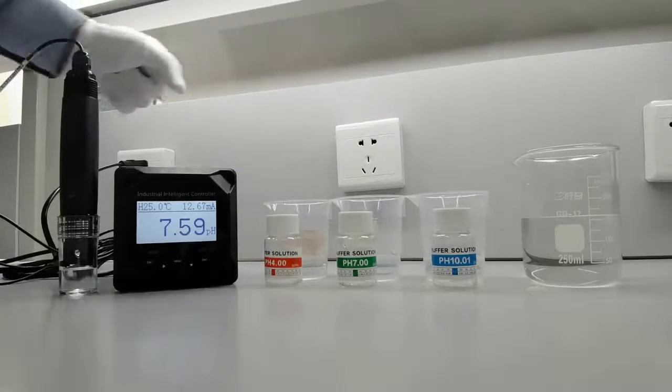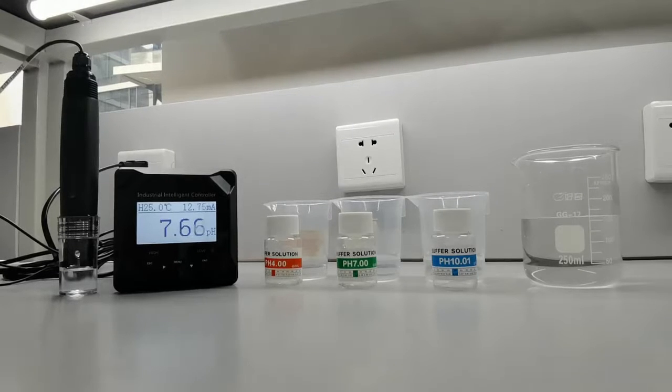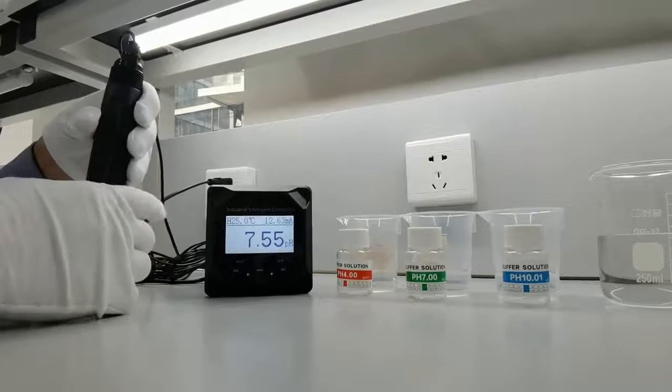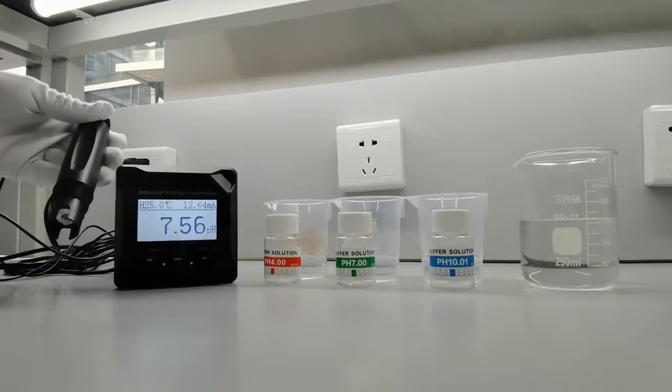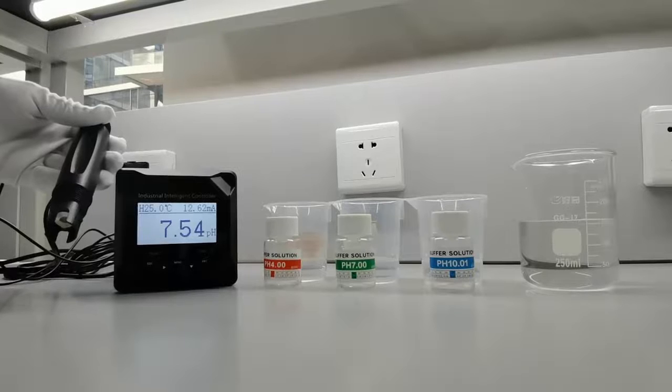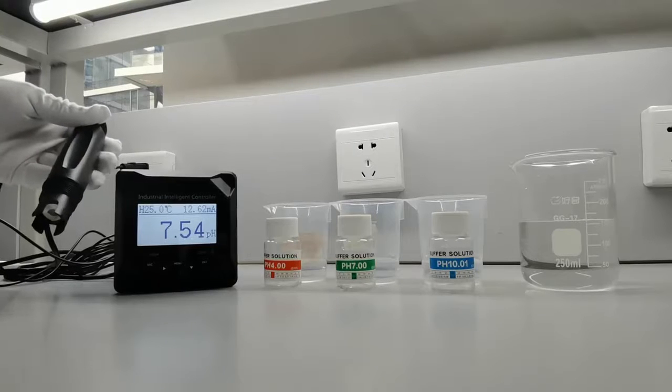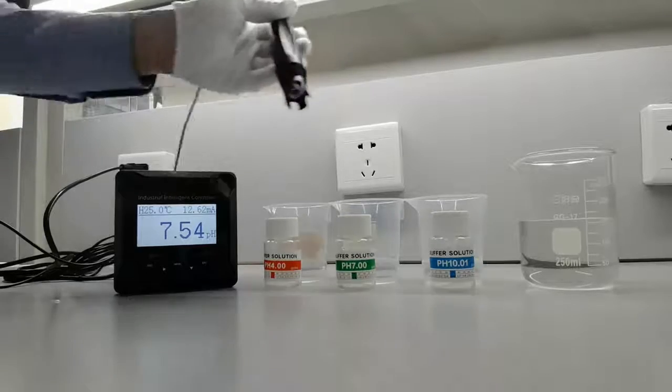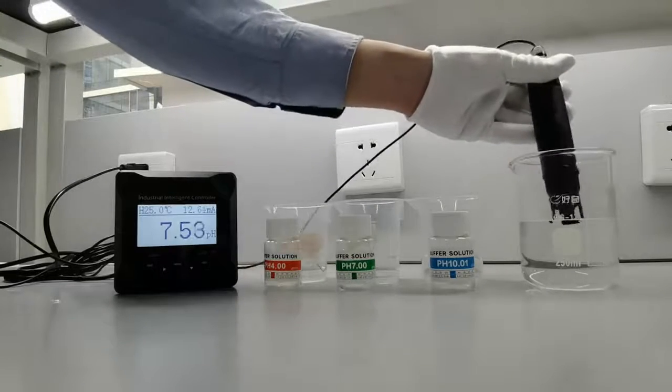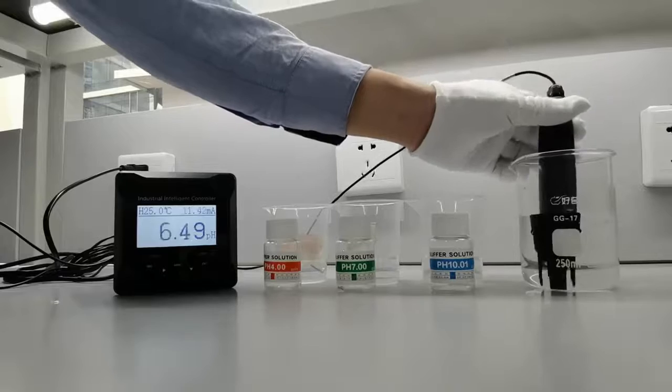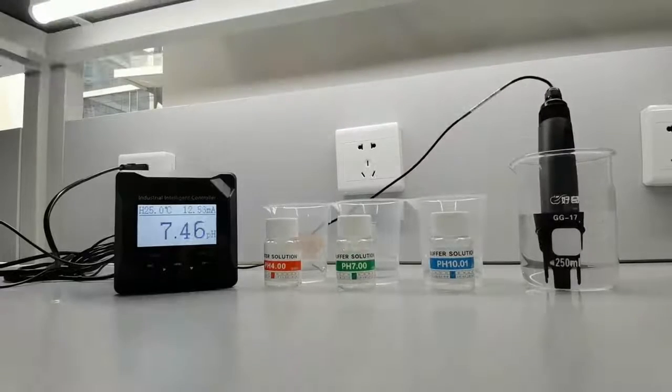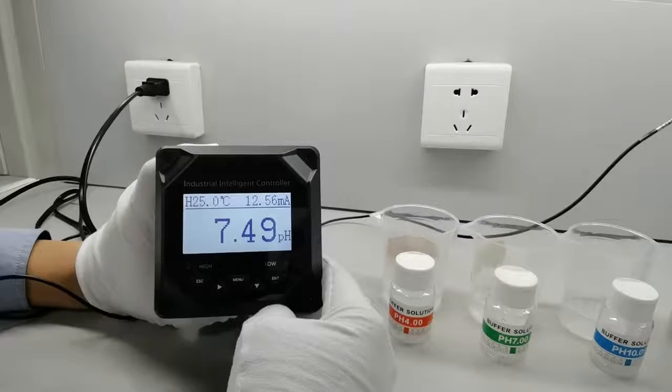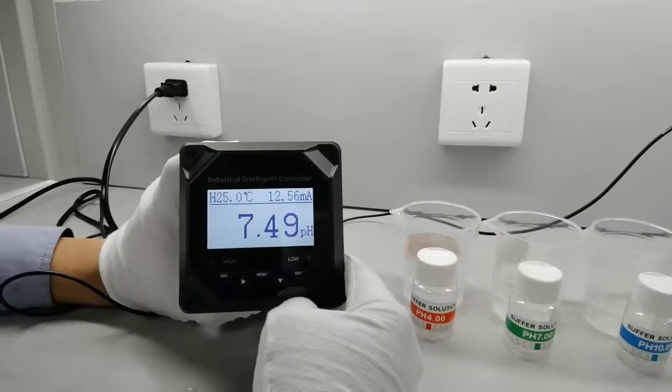The first step is to remove the protective cap. The electrode or pH meter needs to be stored properly and immersed in storage solution to prevent it from drying out. Next, the electrode must be rinsed using distilled water. To calibrate this pH meter, review the manual for proper procedure. To start, let's go to the controller.